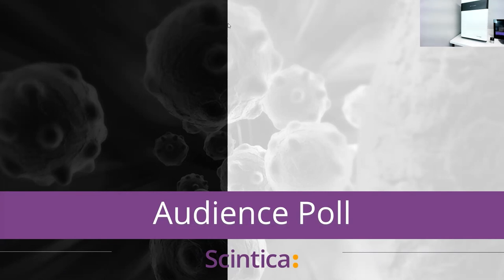So if you remember the image of the blot I showed in the software, you could see the image of the marker in color. So that is similar to a colorimetric Western blot, but you can also use the chemiluminescence, which is the main function of the Fusion FX. Okay, thank you very much, Alexis.